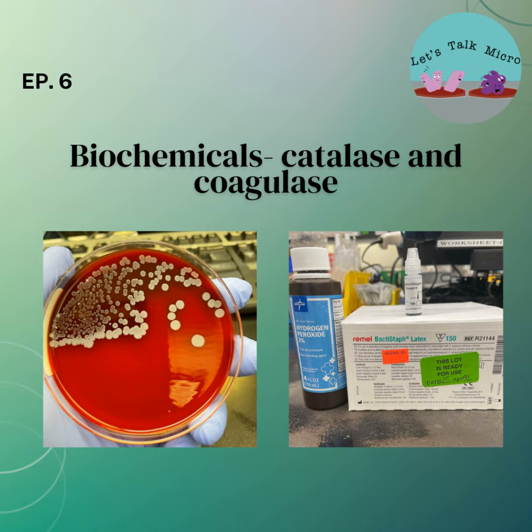Mind you, in the clinical labs, as you get more experience, you can tell a staph from a strep. So a lot of techs don't do the catalase. But as a student, get in the habit of doing all those biochemicals from the beginning. And you start with catalase. Catalase positive, you have a gram positive cocci in clusters, you have a staph.